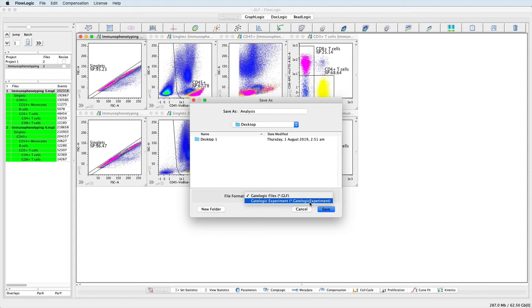The resulting file is bigger and the saving process is a little bit longer, but the advantage is that the single file is easier to share between different people or different computers without having to transfer the FCS files separately.